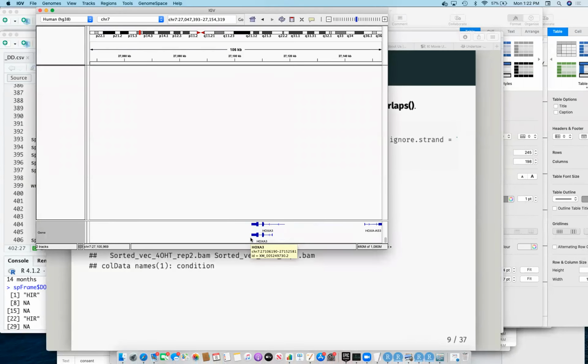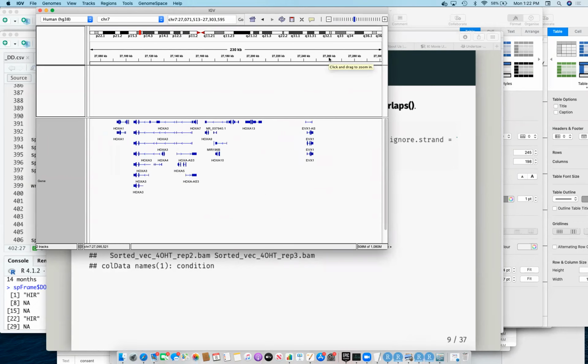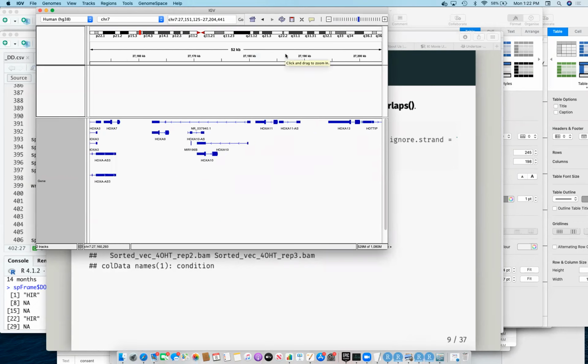I'm not sure if we've got an example here in the Hox region again, but zoom out a bit. Sometimes you'll get genes within other genes. So maybe you do have some examples here. So, you know, HOXA10 is within this other gene here, right? If I have pre-spliced mRNA, which is from nuclear because it hasn't been spliced yet, I will get signal across the whole length of the gene. And then I can't tell, is it from this gene or that gene or this gene, so I just assign it to all of them. I will worry about that later on in my analysis. Okay, look, these genes all overlap. I have to go review it myself.